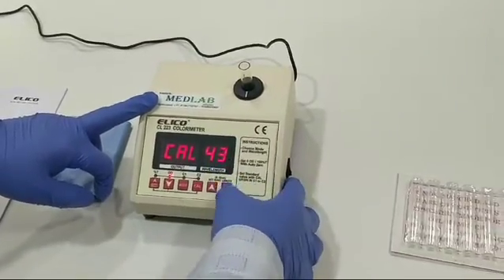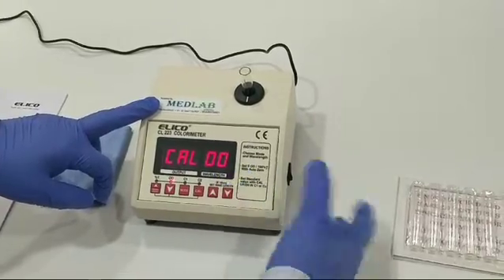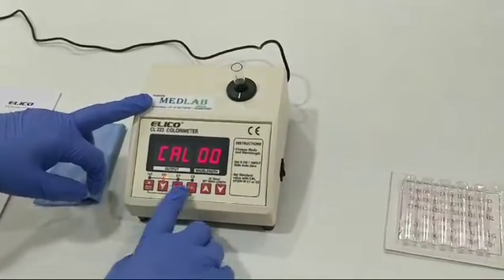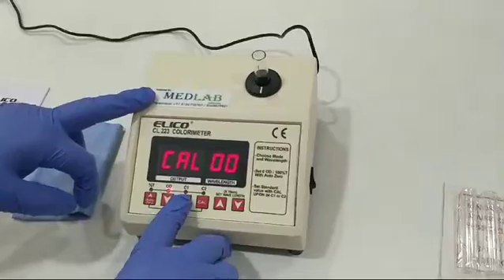The operation is very simple. You just have to click on the appropriate button.